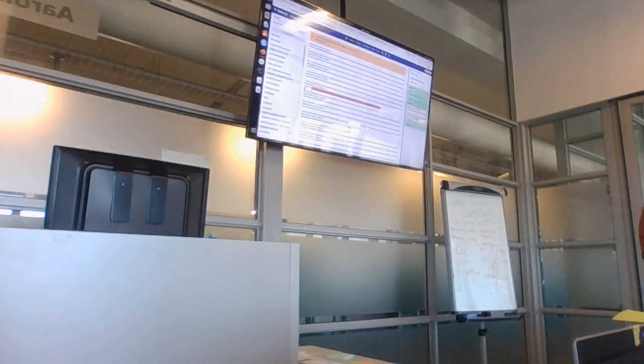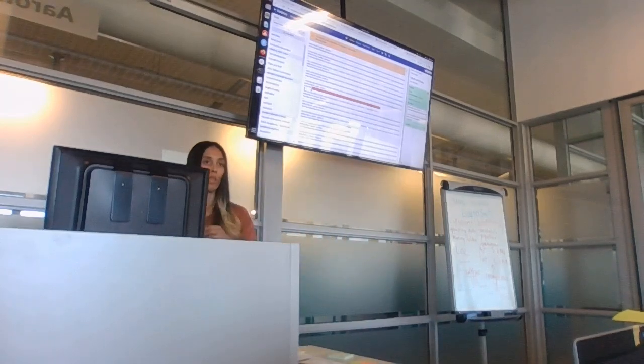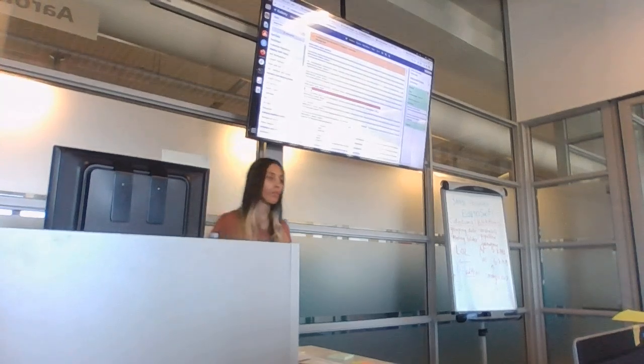For instance, with paired-end reads, you find the forward read has 98 base pairs and the reverse has 100 base pairs. Yes. Because you never find them being 150 or 158. Yes, there are some which have that. She's asking what is the difference between them. Could it have something in it that would not reference on that marker?